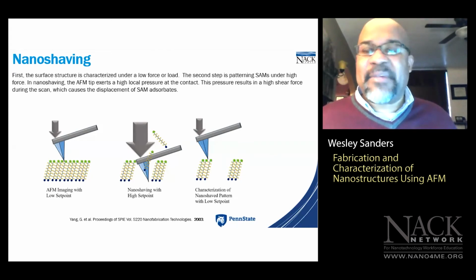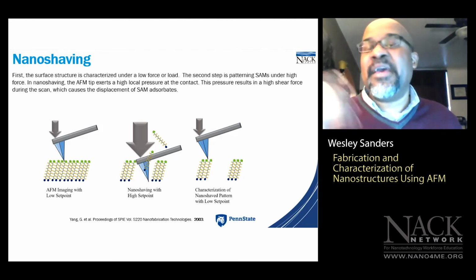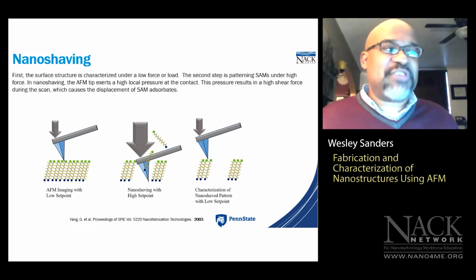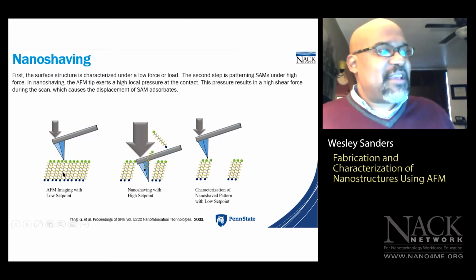So he set up the portable AFM unit, and he has a substrate that's been modified with the polymer film, and he'll be using the AFM tip to etch the film and then subsequently image the structures using one of the specialized techniques we'll talk about towards the end of this presentation. But in any event, as you can see in this picture, we start with a well-ordered molecular film or a self-assembled monolayer assembled on a gold substrate, okay?